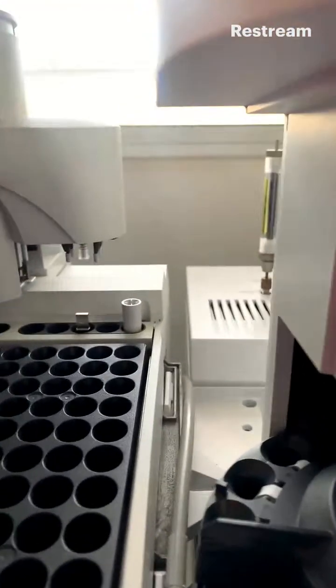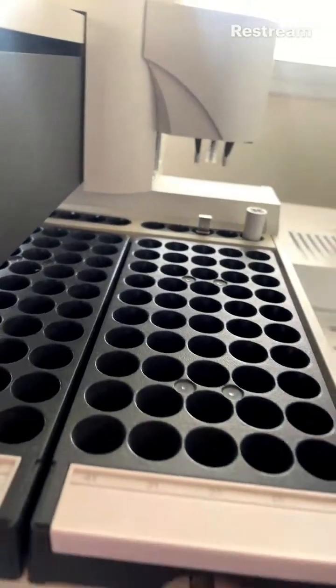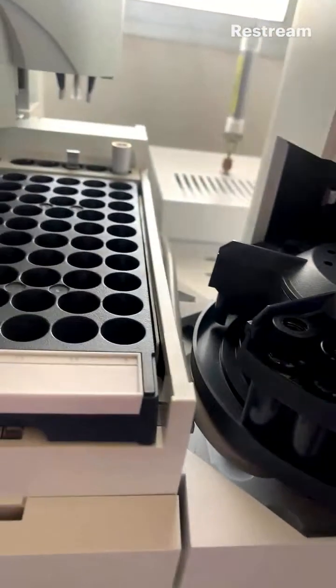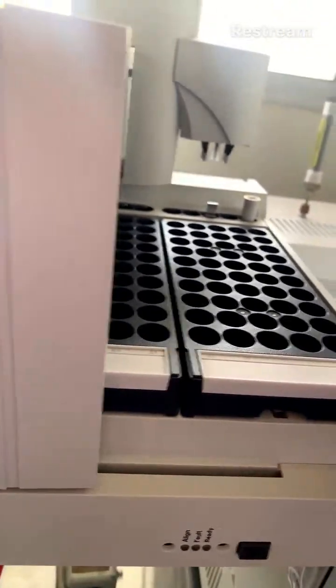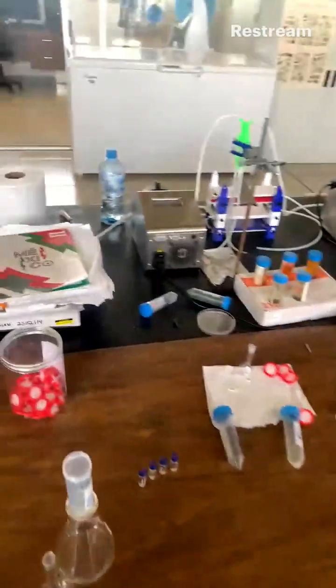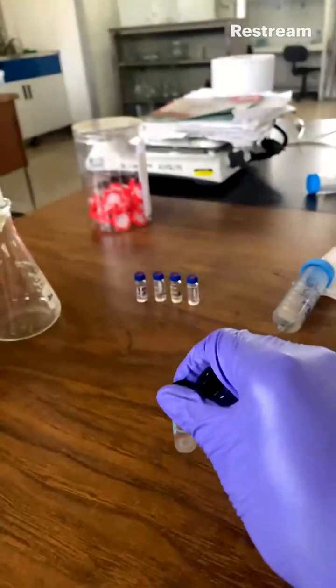But I need to fill up these three bottles too. I need to fill them with isopropanol too, because they will be used to wash the machine.